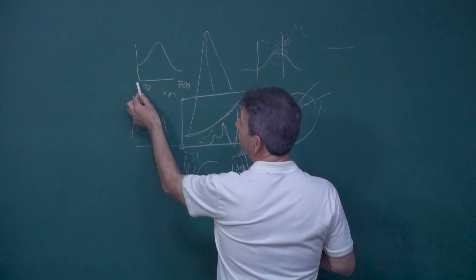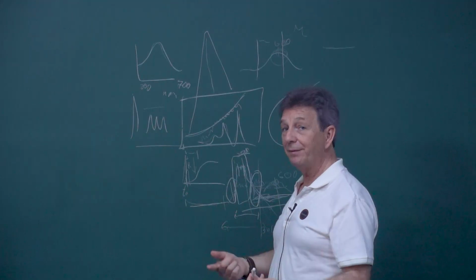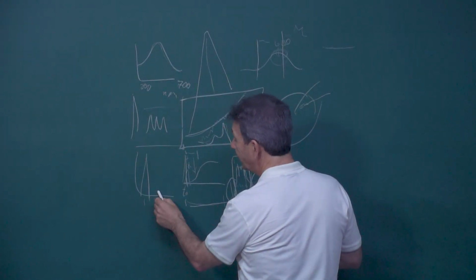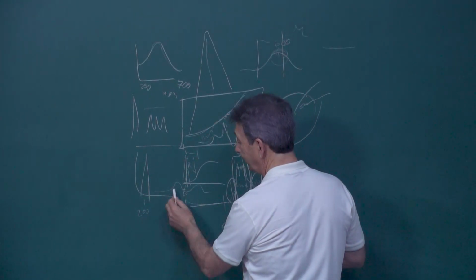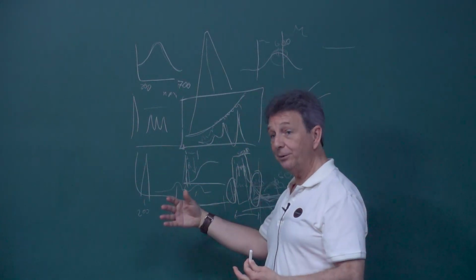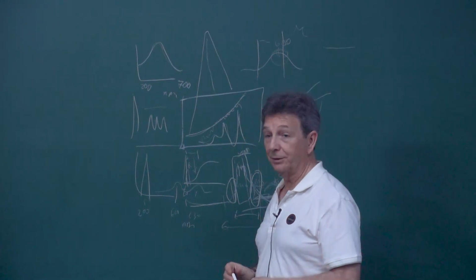Basically, you are using light going through the sample, and then you are recording how much is absorbed. In the case of photoluminescence, you irradiate the sample with a given wavelength, for example 300 nanometer UV light, and then you measure the light that is emitted by the sample. Maybe you excite at 200 and emit at 600 to 630 nanometers. This photoluminescence will tell you about the element you have, its oxidation state, and its environment, and it will depend on the excitation.